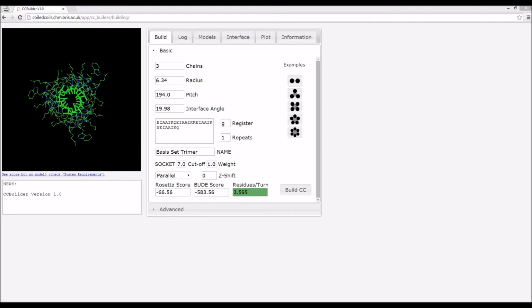While most of the functions that have been highlighted up to this point will cover most people's usage, there are some additional functions that you can use. Firstly, you can indicate heteroligomeric sequences by using arrows.